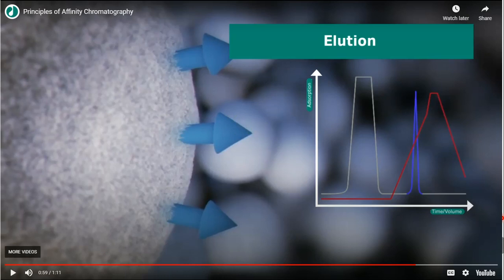But sometimes you have to be very specific that the pH should not denature your protein. If you are using a particular pH that can detach your protein from the ligand, at the same time that protein should not be denatured or degraded, or its activity lost. Your main intention is purification, and the purification should not completely denature your protein. So that is very, very important, and this type of affinity chromatography is very famous. My advice to you is to always use the concentration of free ligands, so that is safe, and at the same time you do not lose the enzyme activity.